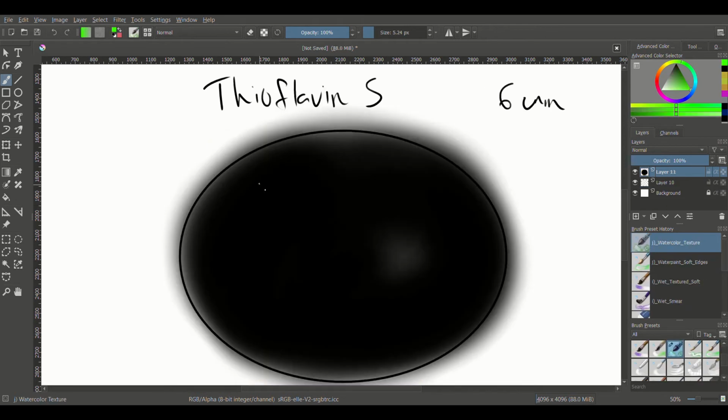So our next stain is Thioflavin S, and we're going to cut that at 6 microns. And this is a fluorescent technique, so that's why our field here is dark. This staining technique is actually super specific for what we're looking for. It's actually supposed to be more specific and possibly cheaper than any of the other methods that we talked about when you're trying to find neurofibrillary tangles and senile plaques.